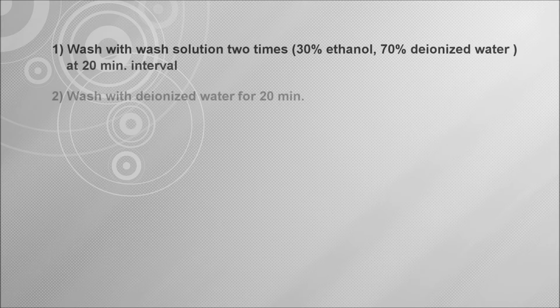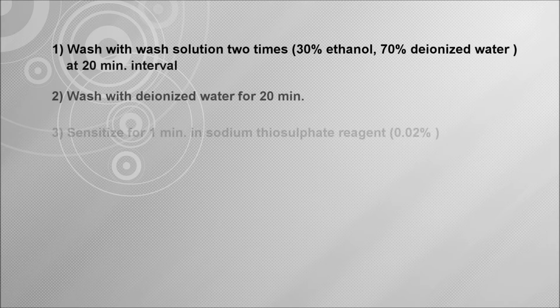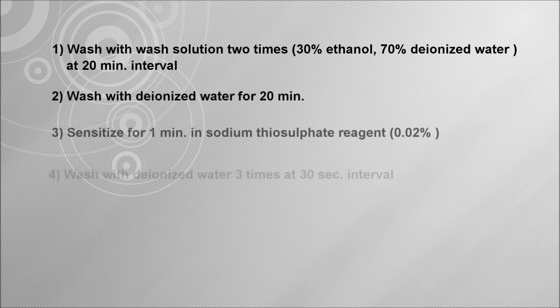After fixation, perform the following steps: First, wash with wash solution 2 times at 20-minute intervals. Wash solution contains 30% ethanol and 70% deionized water. Second, wash with deionized water for 20 minutes. Third, sensitize for 1 minute in sodium thiosulfate reagent at 0.02% concentration.